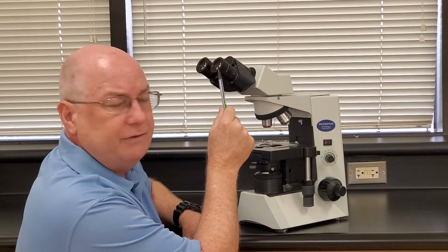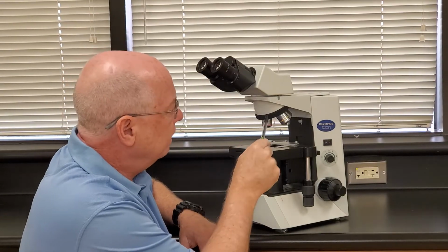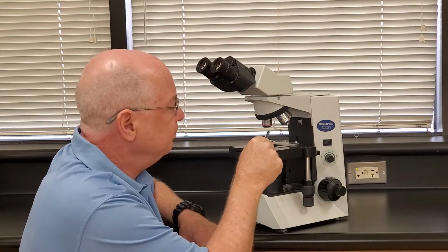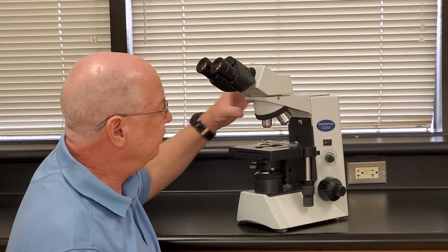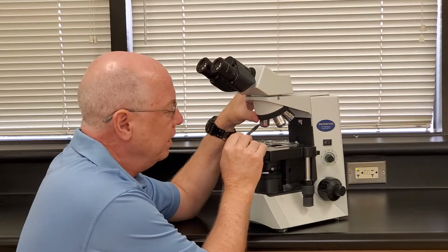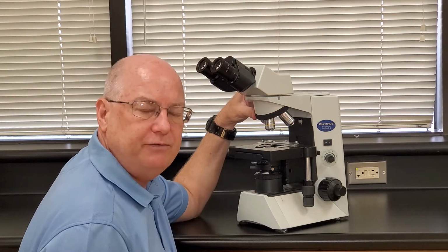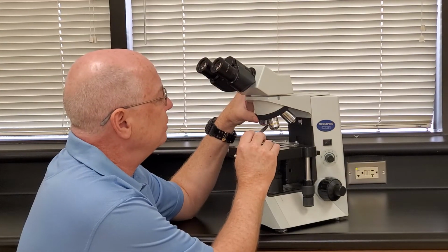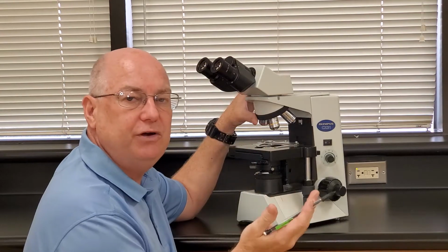Anyway, right now, there's only 4 parts that you need to know. Identify the part, ocular. Identify the dark structure, that would be the revolving nose piece. Identify the silver tubes, those are objectives. Now, if we got specific, this would be the low magnification objective, the red one. The yellow one is called the middle magnification or the middle power objective. If you look at it, it has a 10x on it. 10x times 10x is 100x.